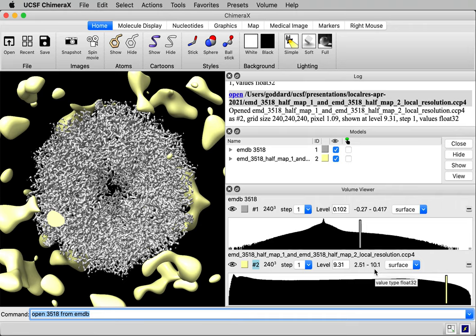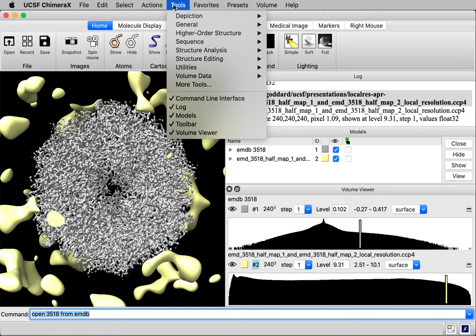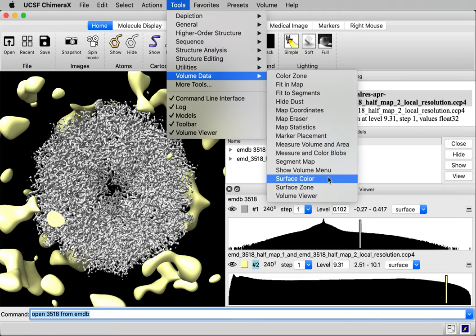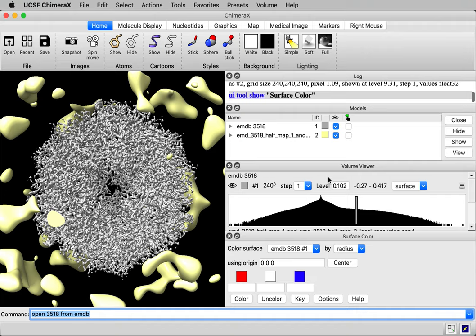I'm going to use a tool called Surface Color. I go to menu Tools, Volume Data, Surface Color. This tool is only in ChimeraX versions newer than March of 2021, so it's not in ChimeraX 1.1. The Surface Color panel appeared at the bottom here.